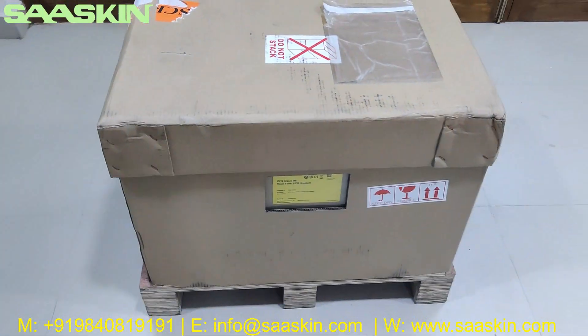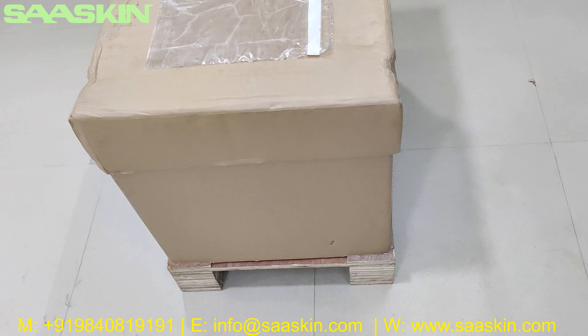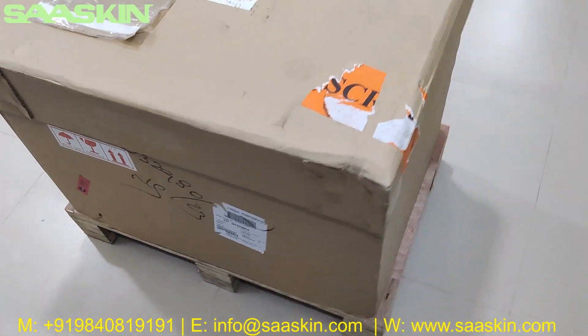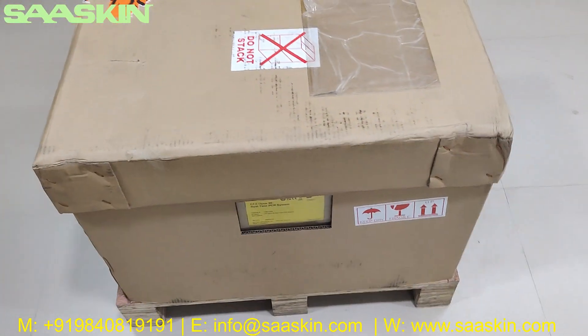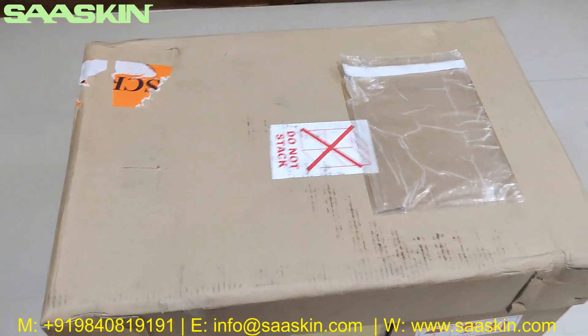This is how the box looks like. It comes with very sturdy packing and you have a pallet. I'm going to unbox this for you and show the contents inside.